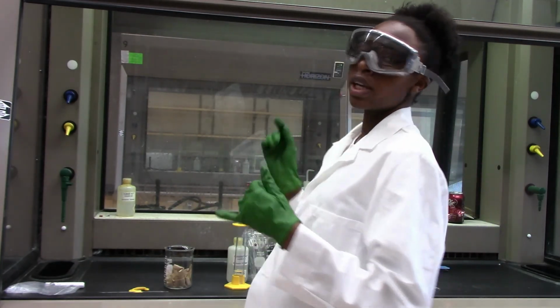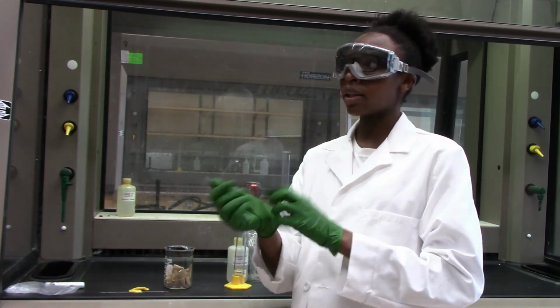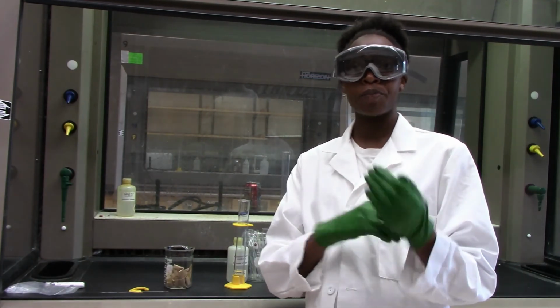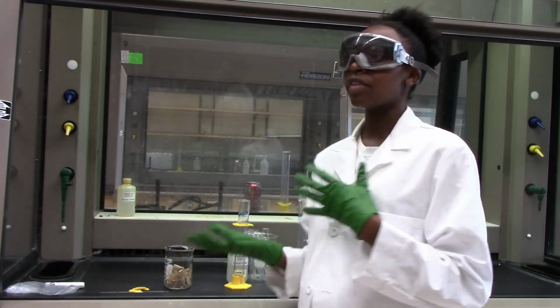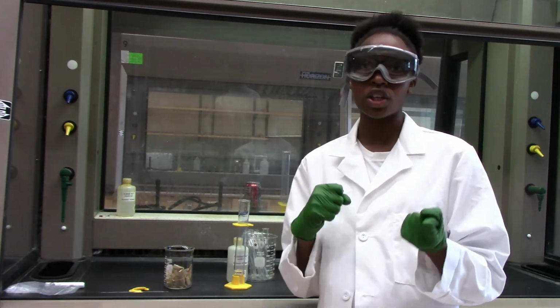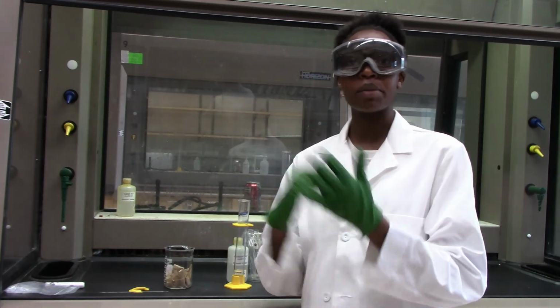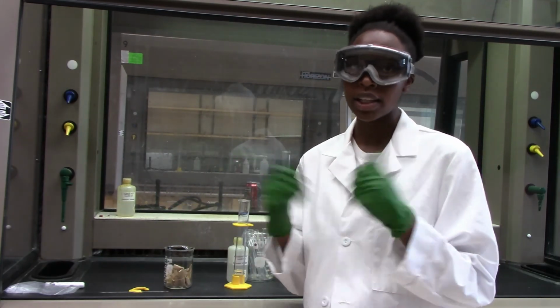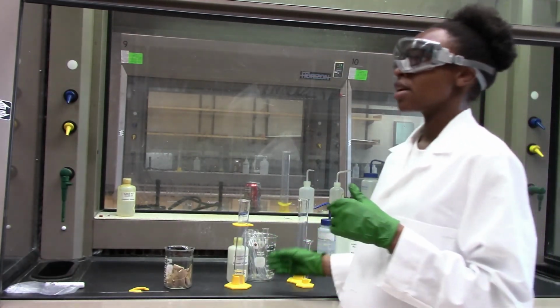And after we prepare the standard solution, we will also prepare the equilibrium solutions that have different concentrations of our reactants. And so that will give us different concentrations of products. And finally, we will use absorbance because we don't have a direct way to measure the concentration of our species at equilibrium. We are going to relate it using Beer's law by taking the absorbance reading for our species, assuming that they are at equilibrium.